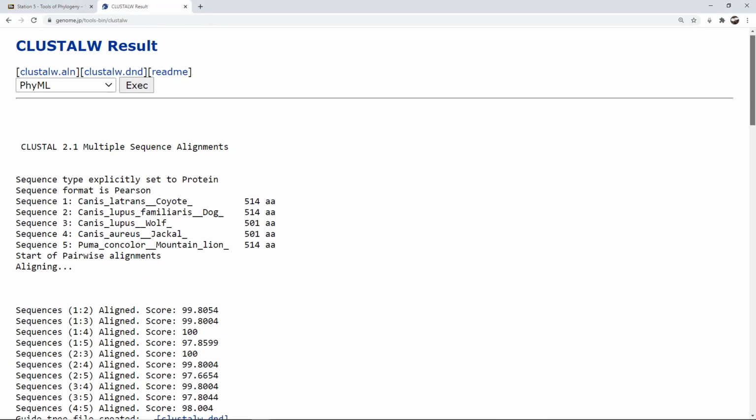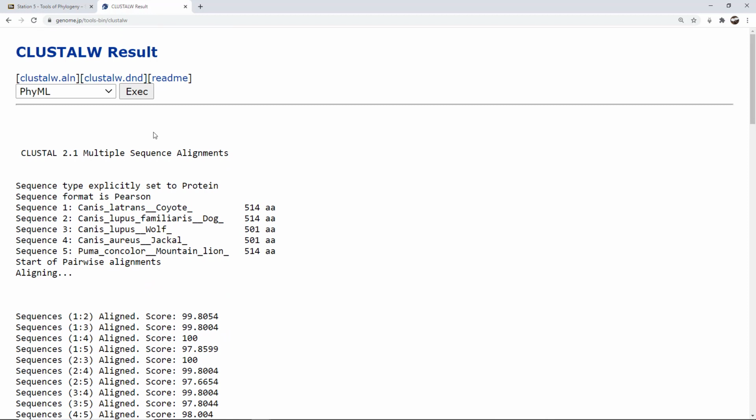One of the most common algorithms is something called neighbor joining, and we see that in the form of this BioNJ and these others. Actually, all of these have some variation of neighbor joining with some tweaking of the particular algorithm, or some kind of a variant, if you will, on that. We're going to use something called PhyML.